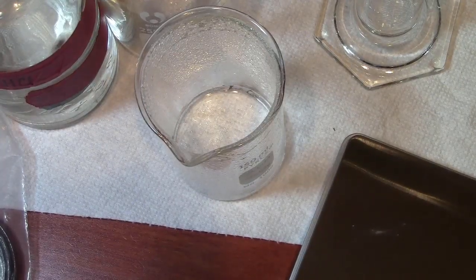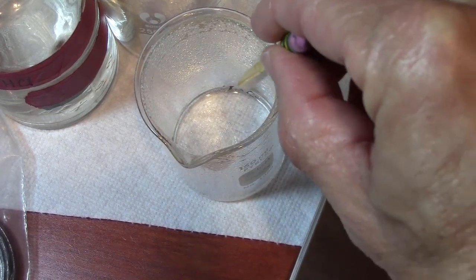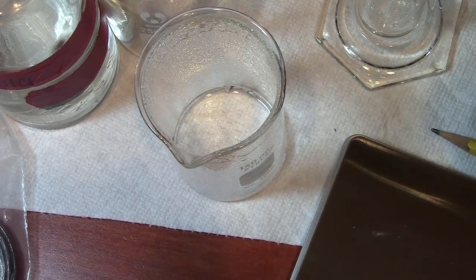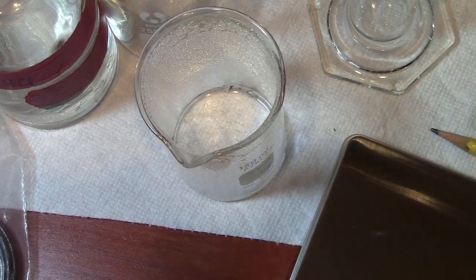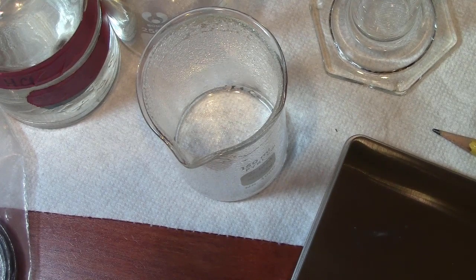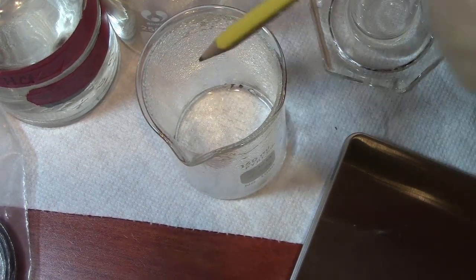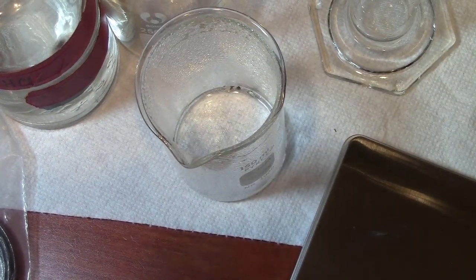So it's been about half an hour. Reaction looks complete. There's some little tiny pieces of magnesium left over, so that suggests my measurement of the HCl was probably a little inaccurate, or maybe some evaporated when it was bubbling and steaming so much. That's a possible reason for leftover magnesium. But I'm happy with it. The solution is clear. That's the magnesium chloride that's aqueous. It looks great.